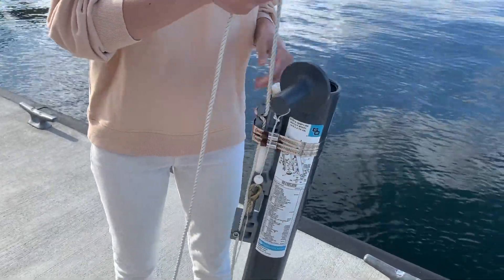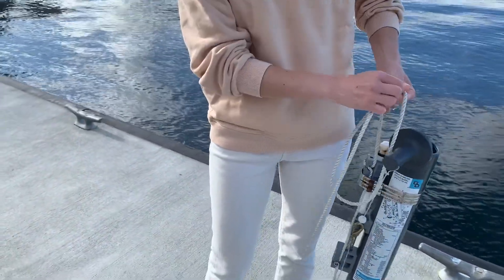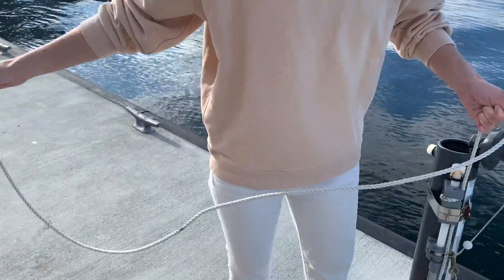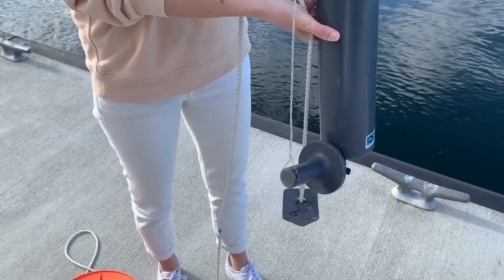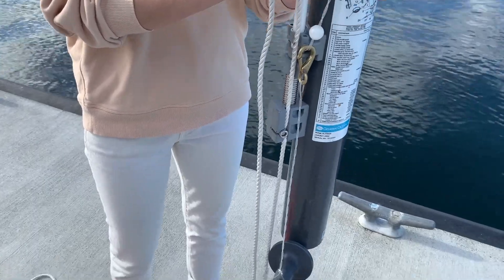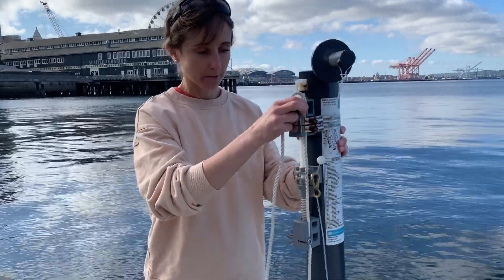The instrument is also connected to a line, and the line is marked every meter with black marks. So there's one meter of line, here's two meters of line. On the other end we have a weight, and the purpose of this weight is to make sure that when we put this bottle in the water it goes straight down, because if it goes off to the side then when we think the bottle's at five meters it's not actually going to be at five meters.